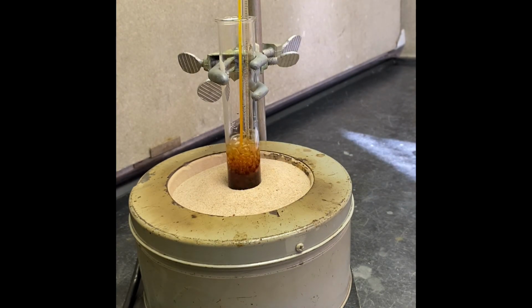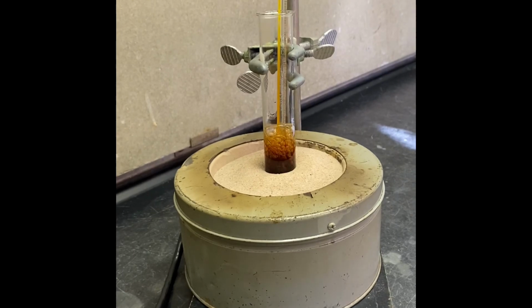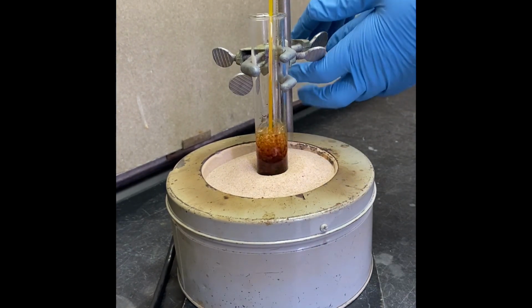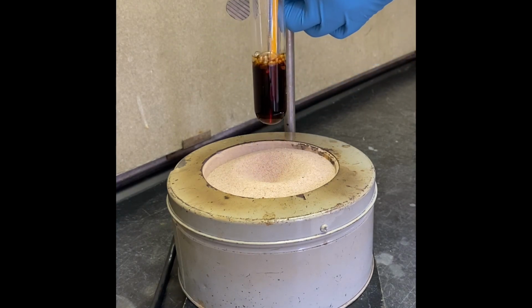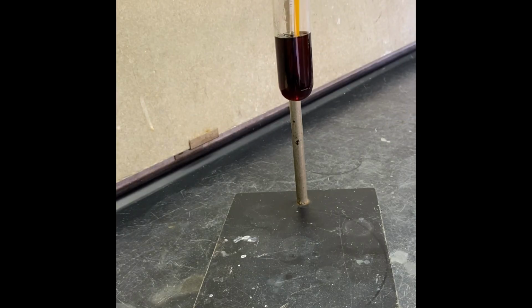It's been 5 minutes, still boiling, and the temperature still same, 185. And now I'm gonna turn off the heat. And gonna lift our reaction up from the sand bath. And now we're waiting for the temperature. It's dropping, so when it's reached 100 degrees, I will pour 15 milliliter of the ethanol to crystallize our products. How it's gonna be, we will see that.